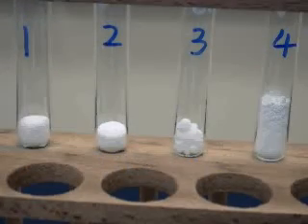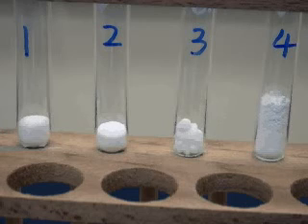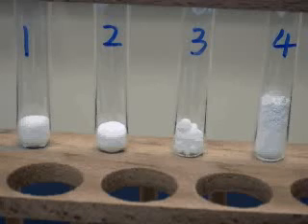In this lab, you will be given unidentified samples of calcium chloride, citric acid, glucose and calcium hydroxide. We will use simple tests to identify each solid.